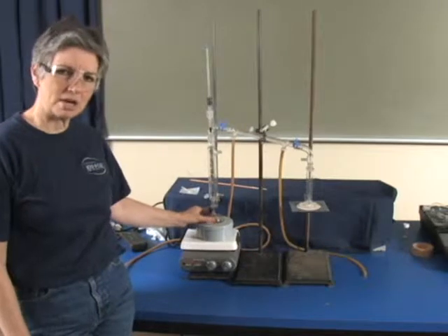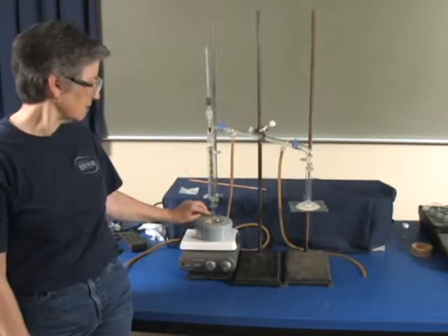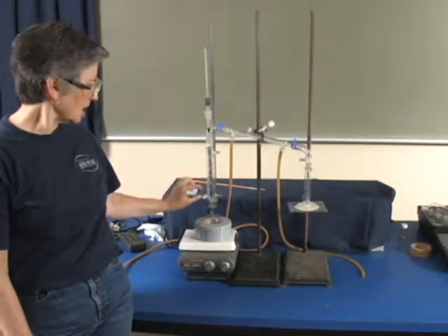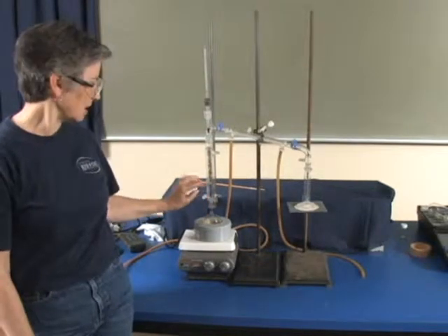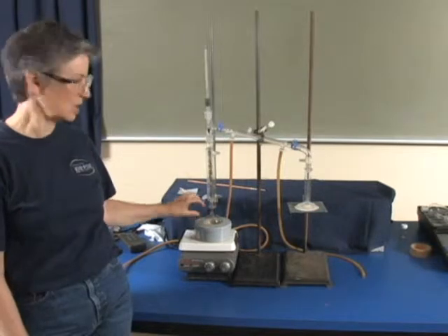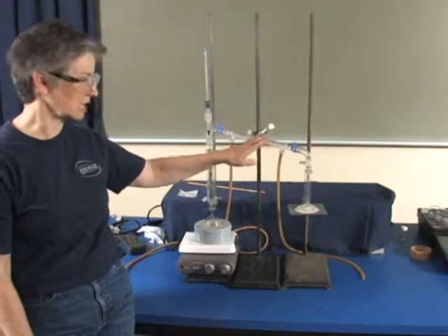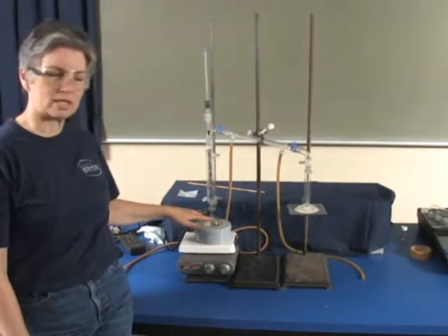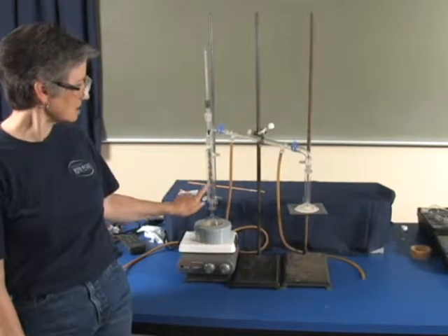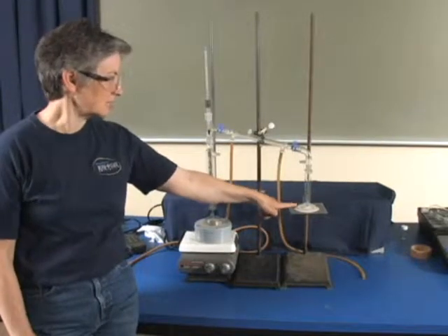What's in your distilling pot is a mixture, even if one component is just a slight impurity. The lower boiling components, vapors, will come up first and condense and run back down. And then the lower boiling component again will come up first and condense and run back down. So you end up with separation. The lower boiling component comes over first and distills over. The higher boiling component, or the impurity, stays in the pot. As it distills, it comes up and runs over into the distillation receiver.